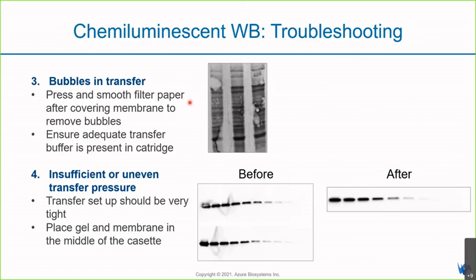You shouldn't press it too hard, right? You should just roll it off using the specific roller. Okay, just remove the bubble. And also, please ensure that you have enough transfer buffer in the cartridge.